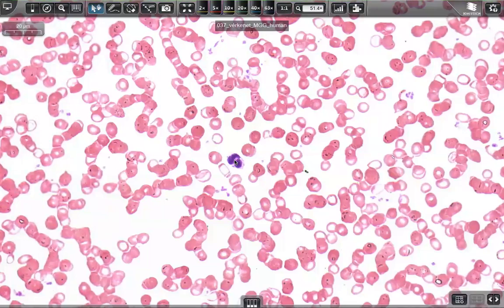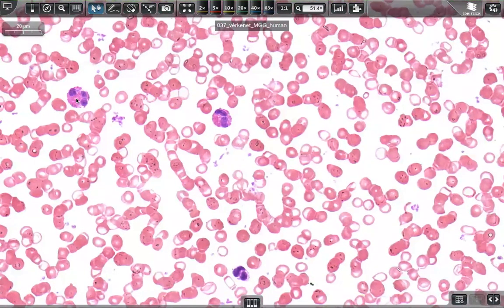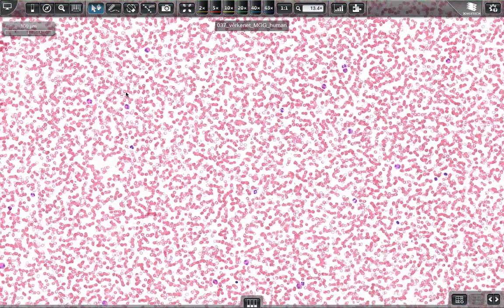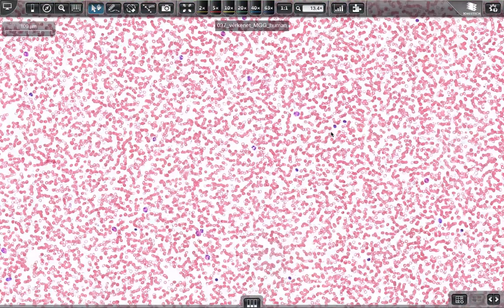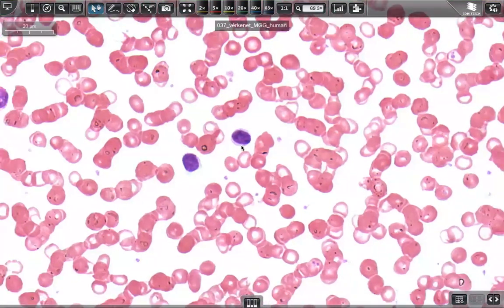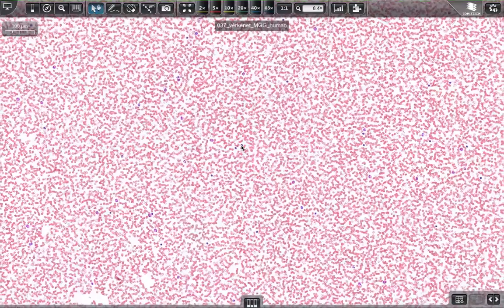So neutrophil, eosinophil. No, I don't want to waste the time finding the basophil. Okay, now let's move on.